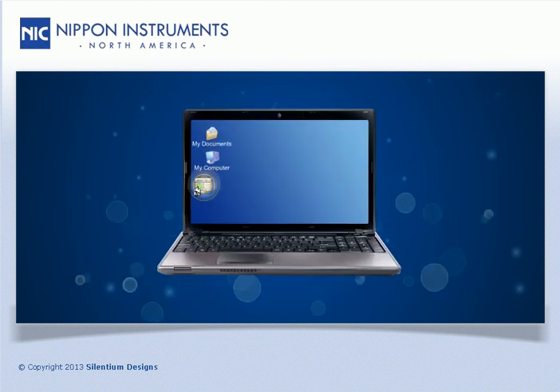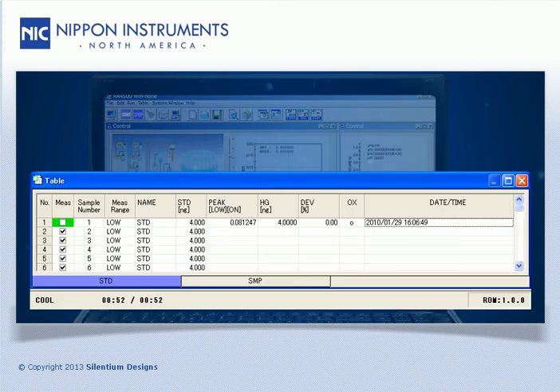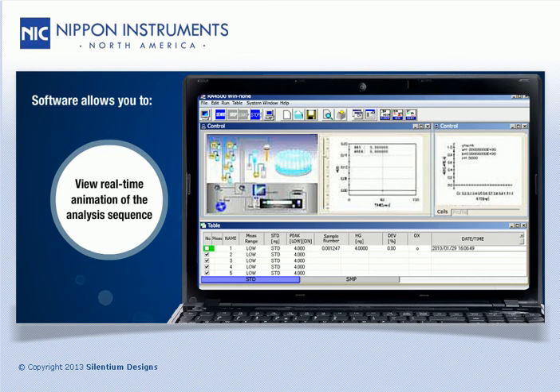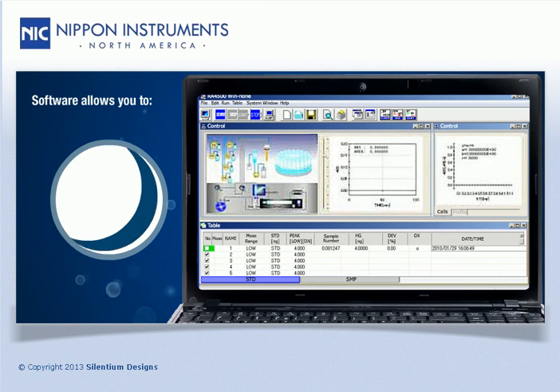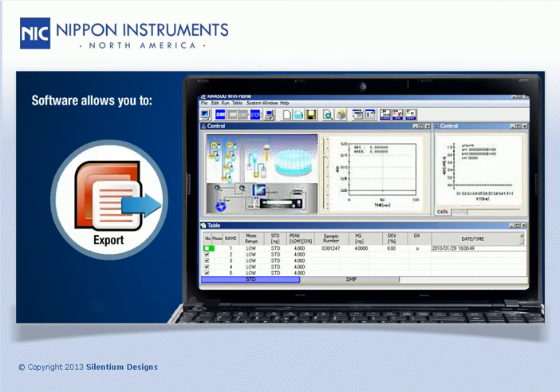The software uses a simple Excel spreadsheet style sample sequence and is very user friendly. It includes a real-time animation of the analysis sequence that allows the user to follow along during each measurement. The sample sequence is easily edited at any time during operation, allowing the user to add or remove samples with ease. Once results are obtained, they can be printed directly from the software report or exported to a LIMS with a simple click of the mouse.